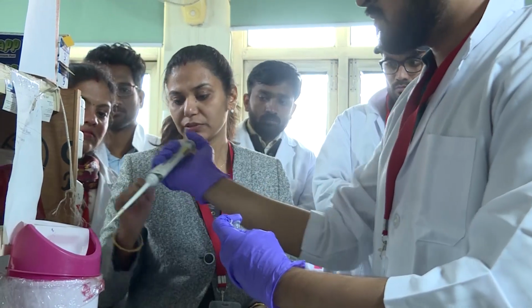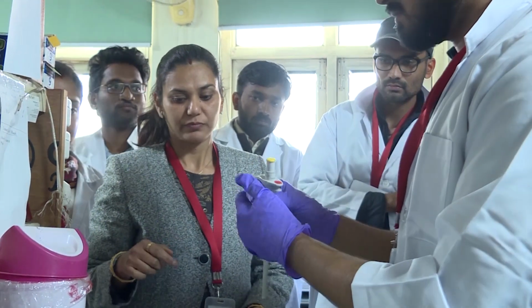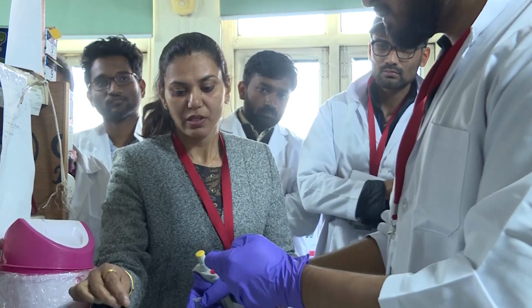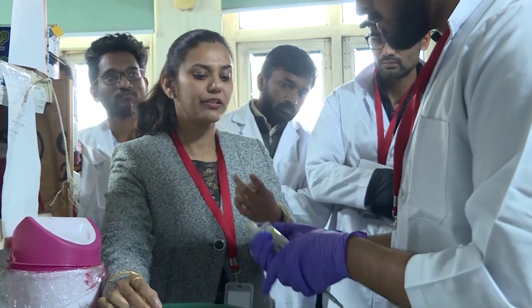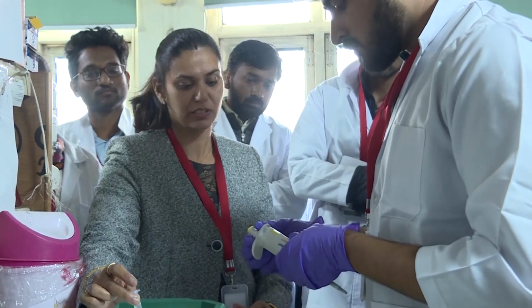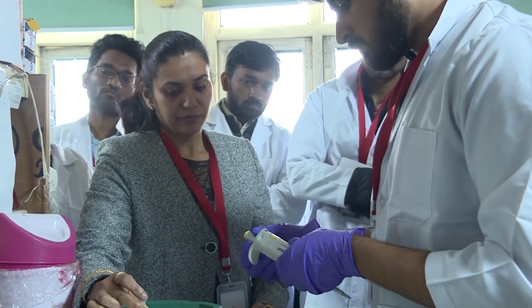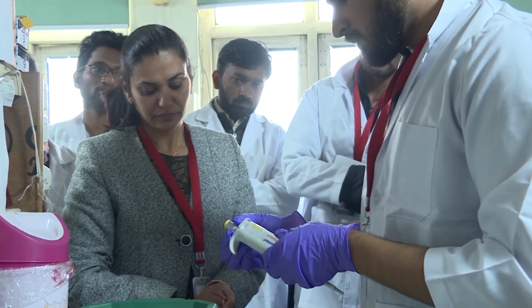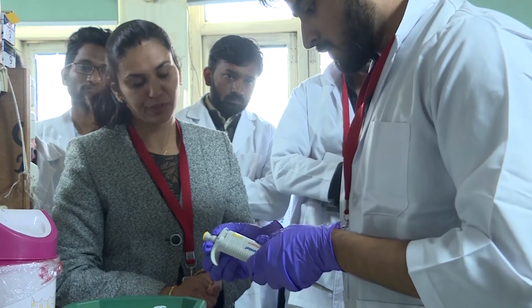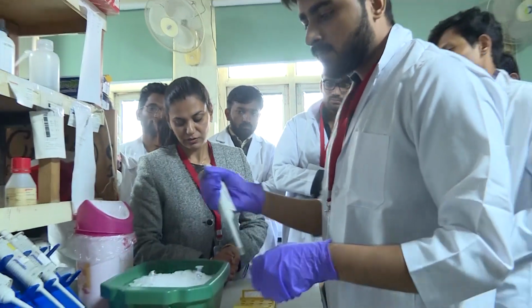Discard the tip. Now you have to add water, nuclease free water. So 65.6. First set your pipette at 65.6. Okay, so you add it.